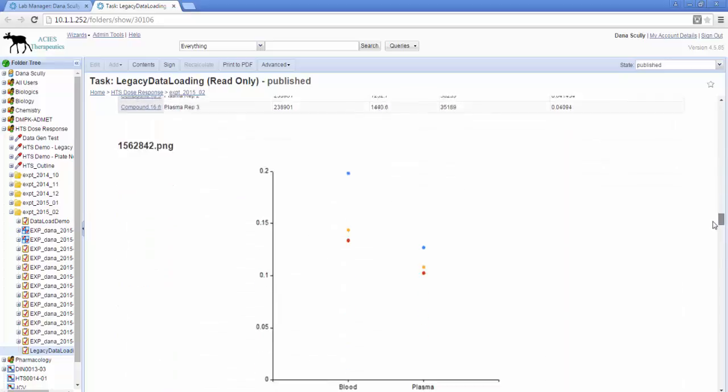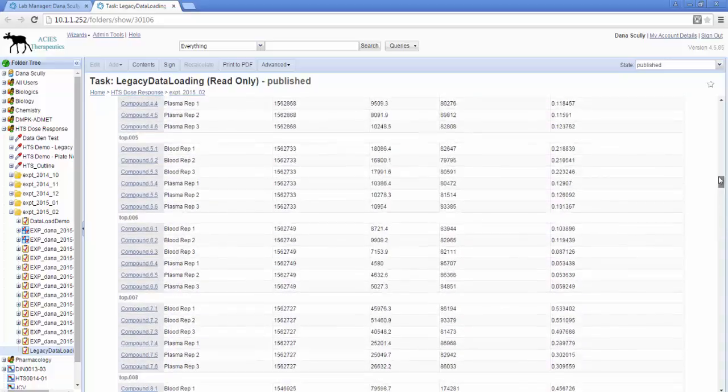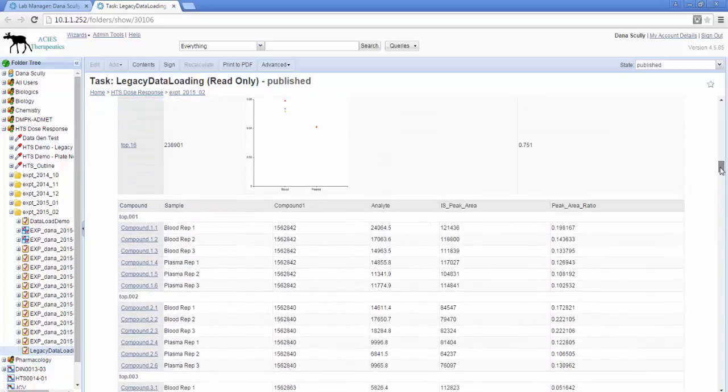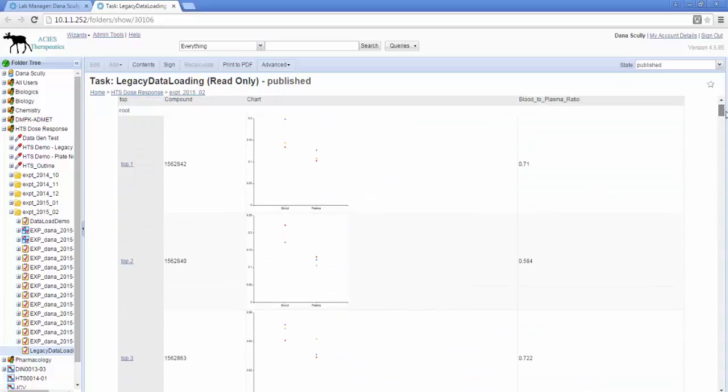And everything's been stored on BioRails so it can be searched for along with all of your new results as well. Thank you for listening. That concludes our demo.